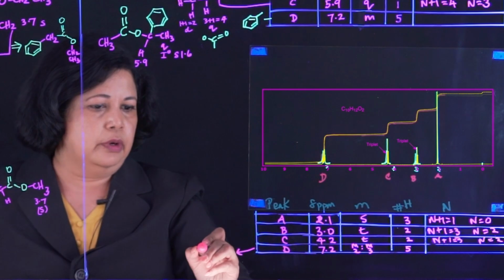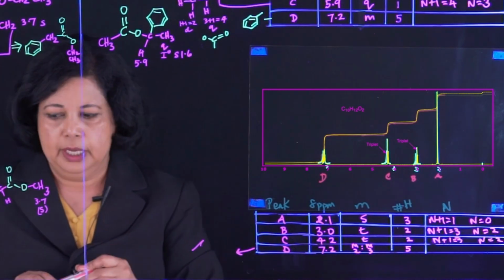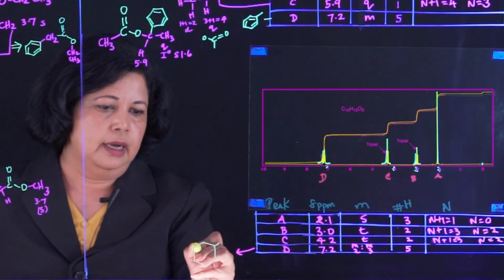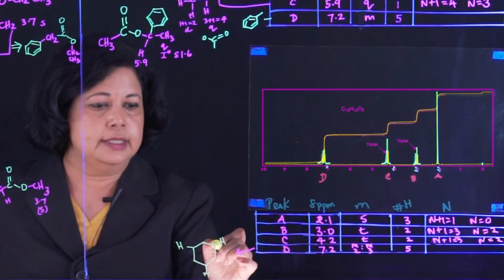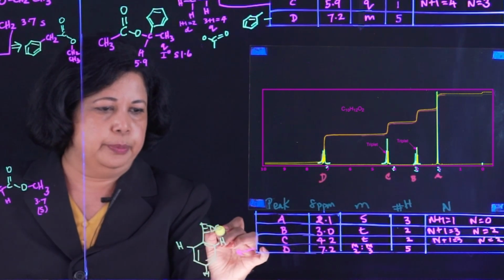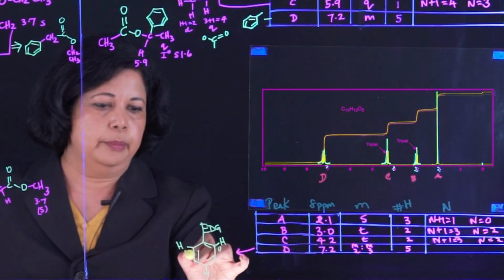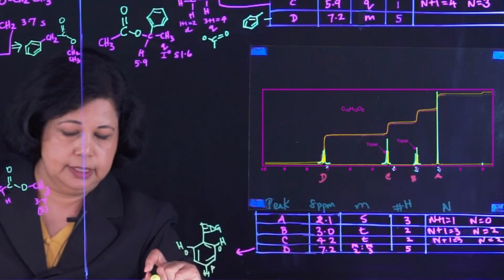So therefore, we already looked at this. When you have a benzene here, you are going to have a substitution pattern where you have 3 hydrogens that are shielded. That means they have an electron donating group here, which means when your electrons go in, the resonance makes these 3 carbons, ortho and para, more shielded, because that's where your electrons land in your resonance structures.